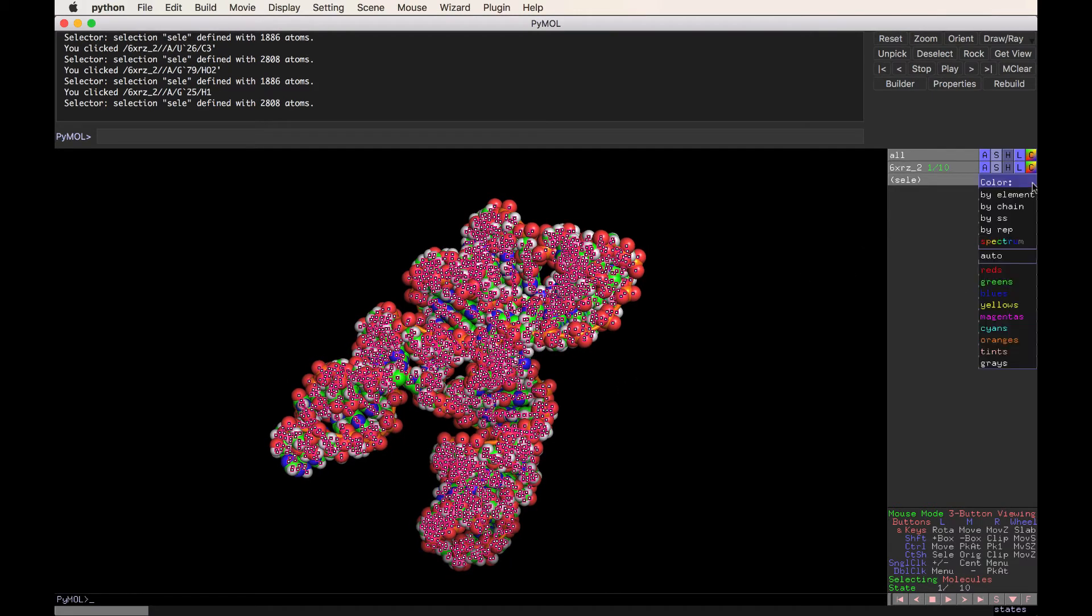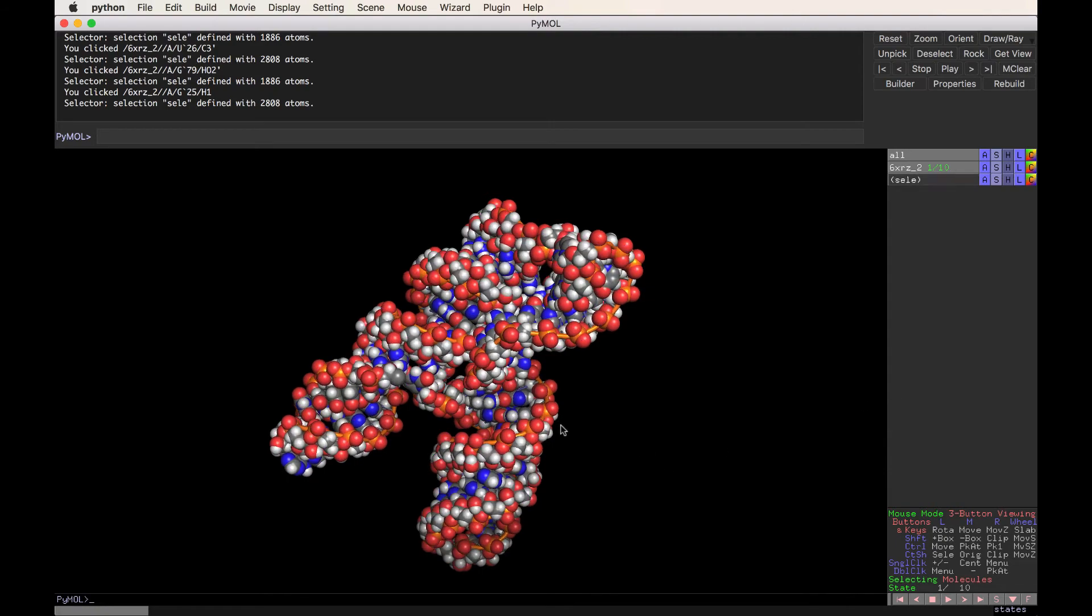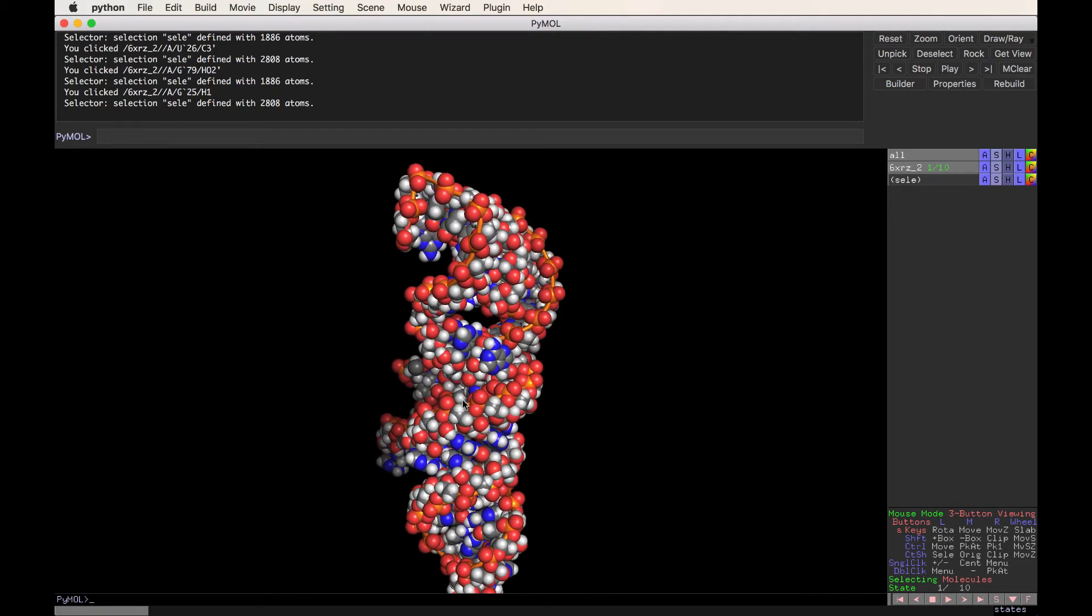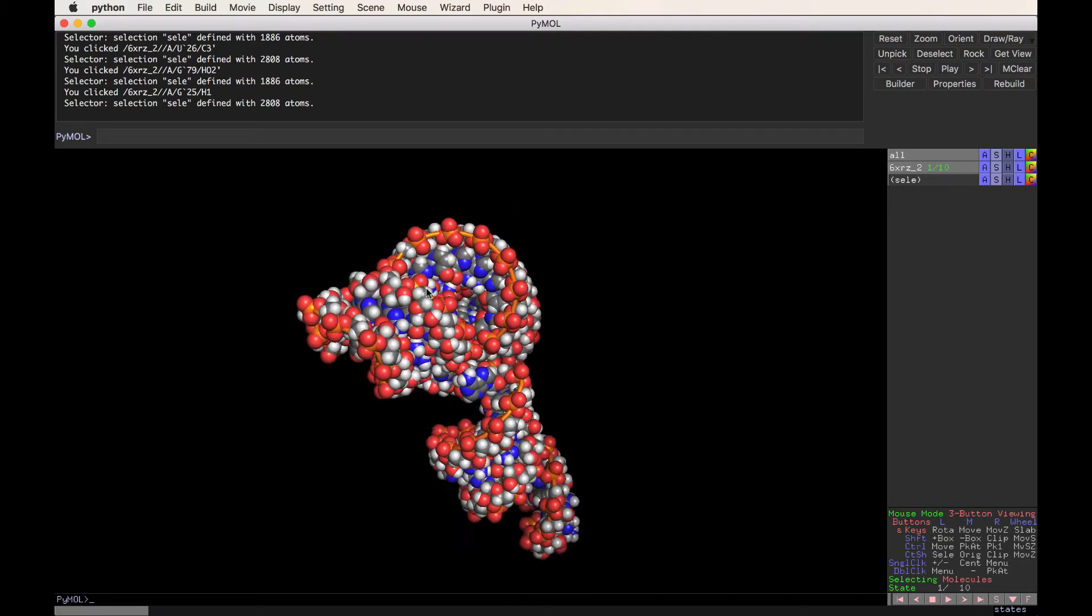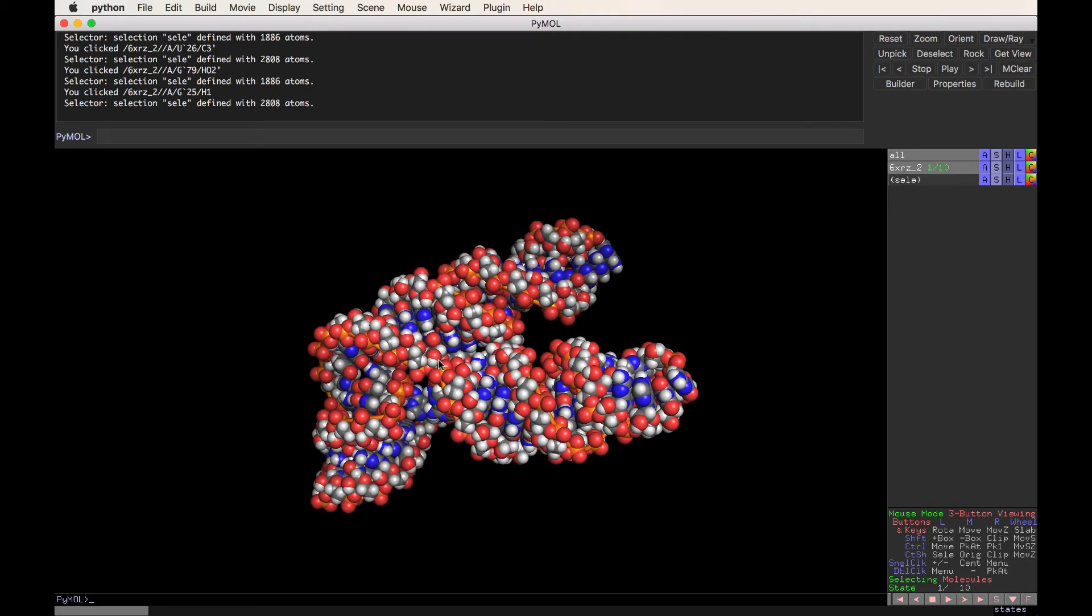So click on the S and then click on spheres, and now we see all the atoms which are making up this molecule. We may also want to change the color to the familiar colors that students are used to that are the gray carbon. So how to find it is the way I'm showing you right here, and now we have the nice gray carbons that we're used to.